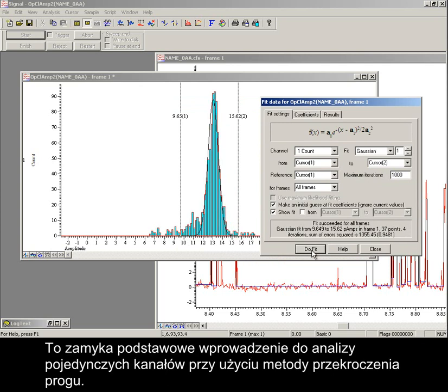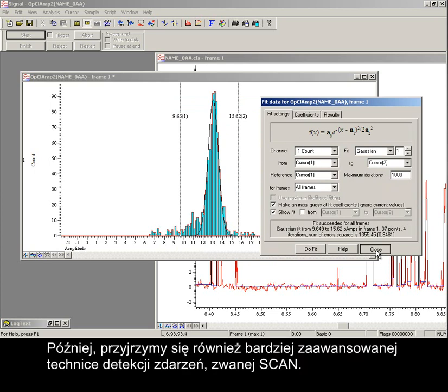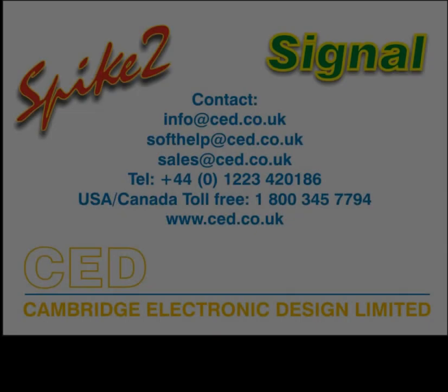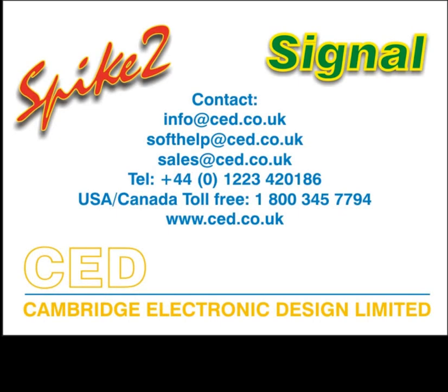So that concludes this basic introduction to single channel analysis using threshold crossings. Later, we will also look at the more advanced scan event detection technique. Thank you.